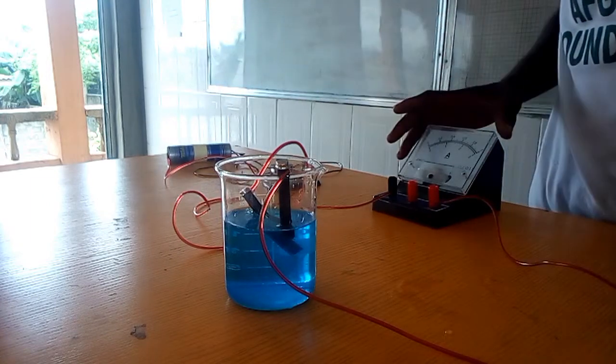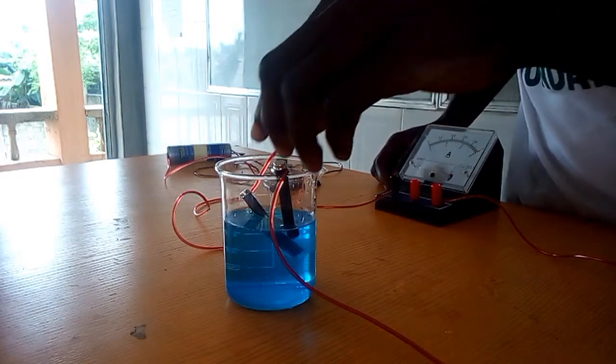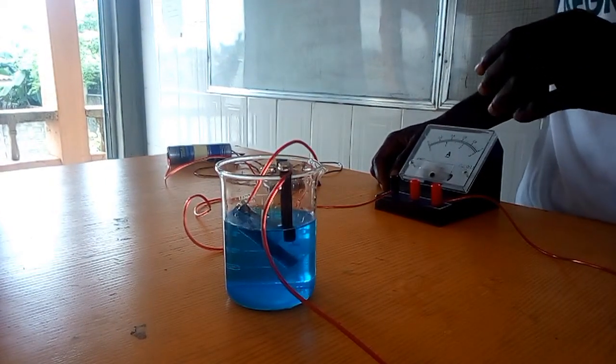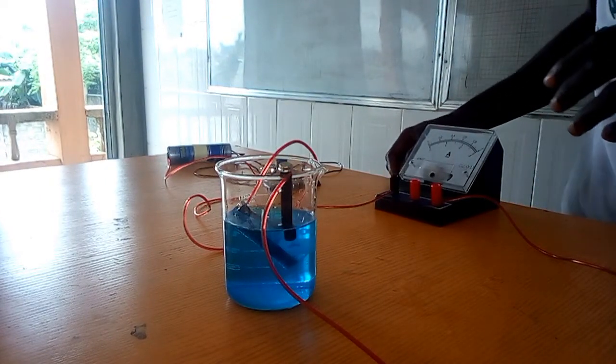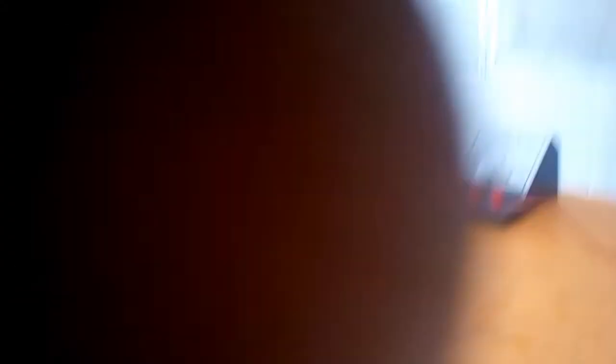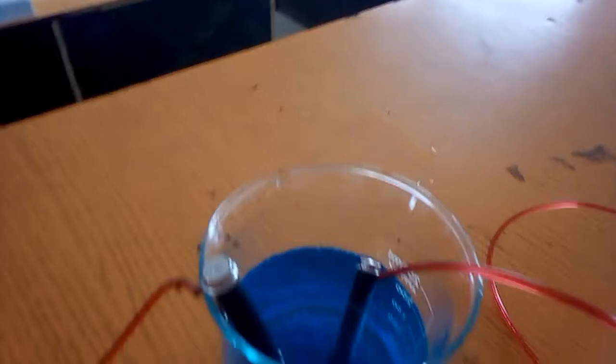There is formation of copper at the cathode and formation of oxygen gas at the anode. So let's take it around. You see the bubble of oxygen gas around the anode and you see a change in color of the cathode. Look at the process, look at the arrangement.